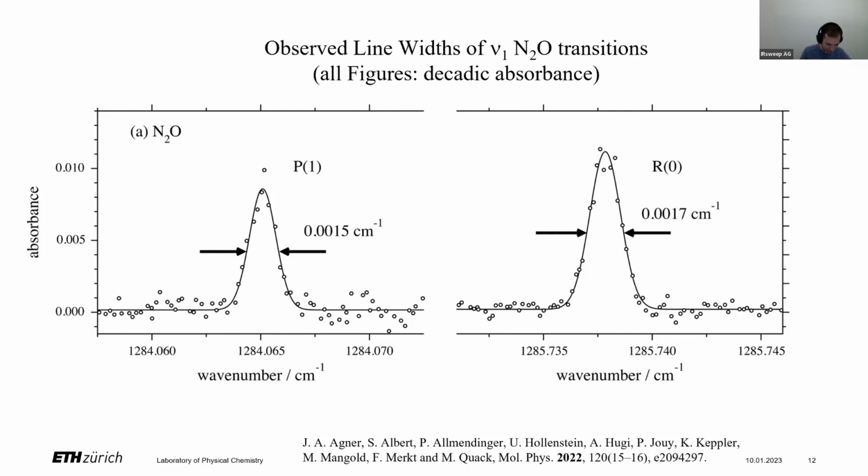Muriel Lepere asks, are you limited in your measurement by the SNR? If so, what is the limit? The limit of the SNR we've discussed, but the first part of the question, Karen, was: is SNR limiting for your analysis? Not really, no. Generally, we were able to pick out the transitions that we needed to pick out. So I'd say it wasn't bad, no. Okay, good.